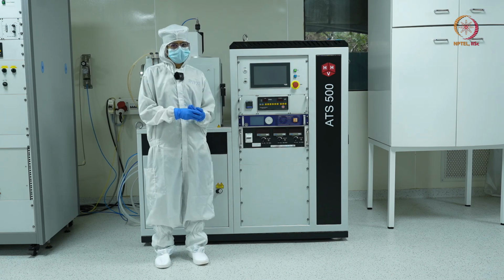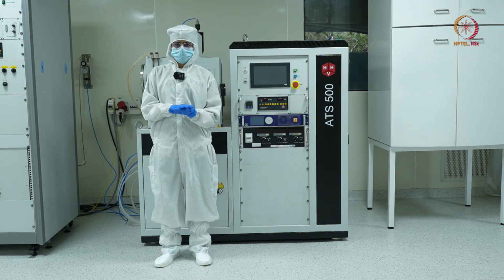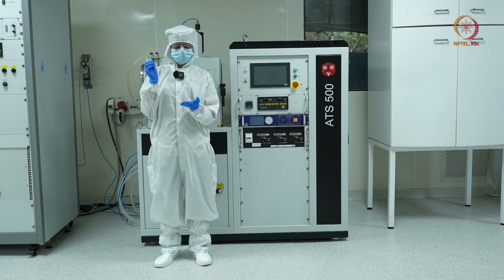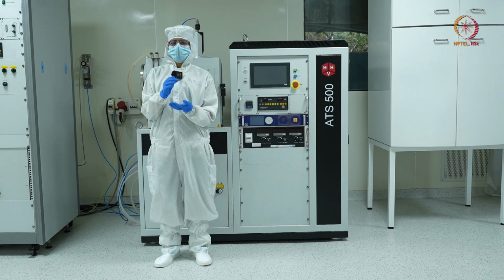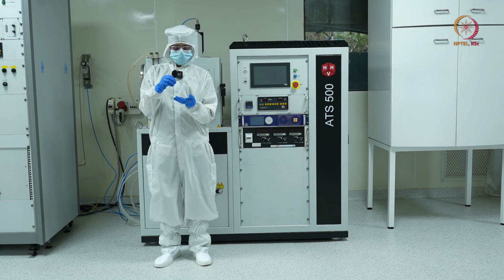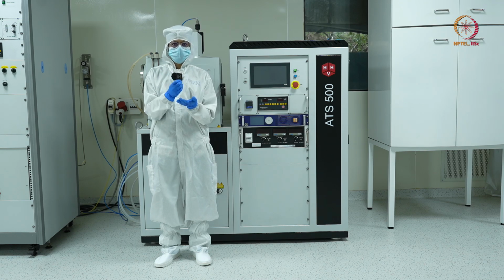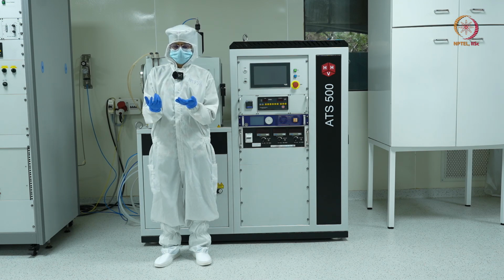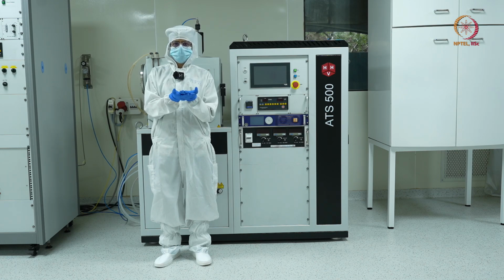which is called sputtering, wherein we have the target, which is the source material. We are bombarding argon atoms onto this target. We have a very high electric field near the vicinity of the target, and whenever these argon atoms come inside the vicinity of this electric field, they get ionized, and my target is at a negative potential.